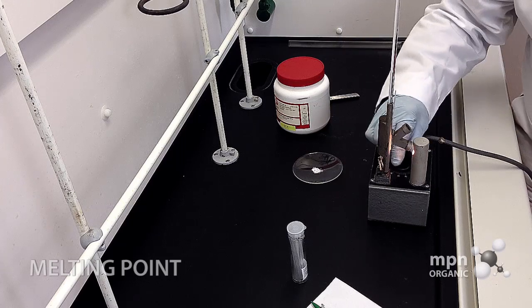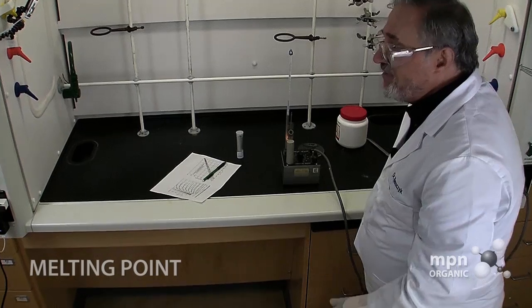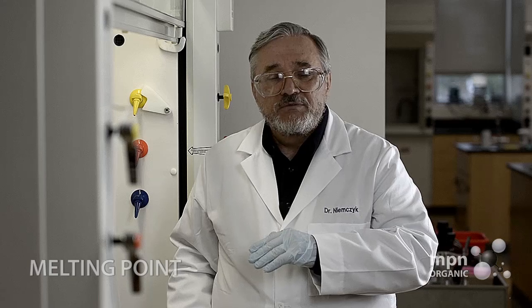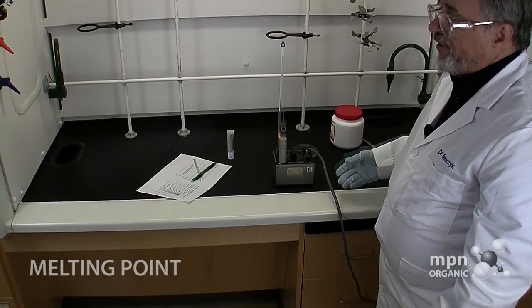If I want to set this up higher, I could do that. If I want to set it lower, I could do that. But I've got to set it at least to the voltage that will give me a reasonable rise in temperature and get up to over 135 degrees. So that's what I've done right here. And now it's just a matter of waiting.